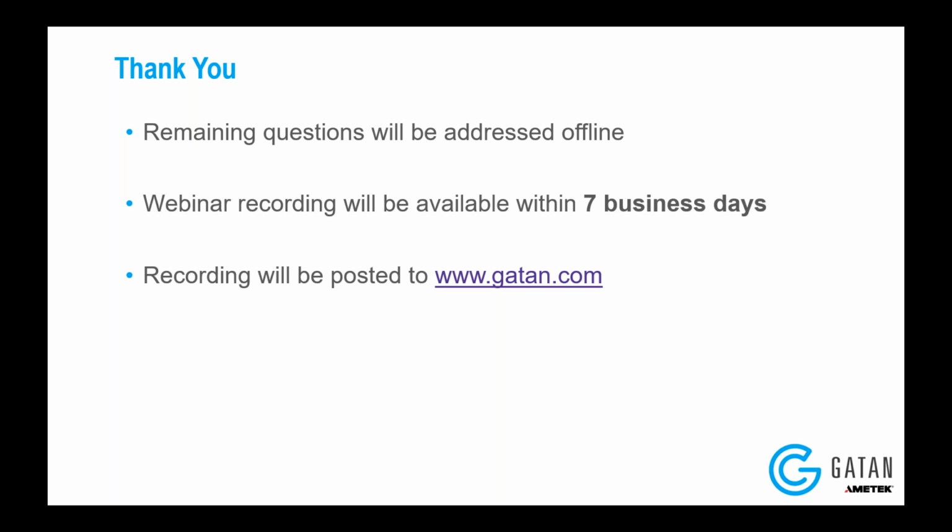Okay. Last one before we go. Are all binning and sub area readout functions available without the IS option? So the sub-area readouts are only available with the IS option. The binning options are available for the base camera, as we call it, and also the in-situ version. But if you're interested in having the maximum frame rate and having the control of these sub-area readouts, that requires the in-situ version of the camera.